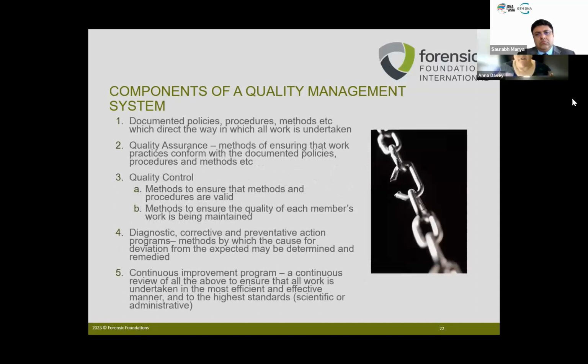So basically, the 5 components of a quality management system are outlined here. I'm often asked, particularly when people are setting up, from the beginning, well, what should we focus on first? What's the most important bit that we should actually be doing? Well, I can't answer that question. Each bit is equally important. What order you do things in, how you do it is up to you.